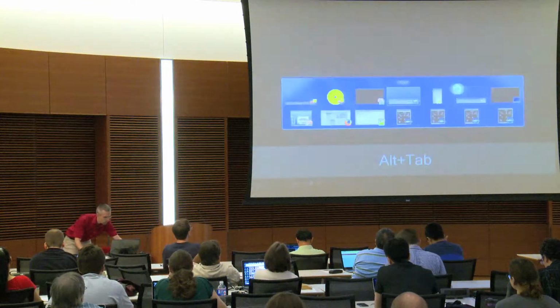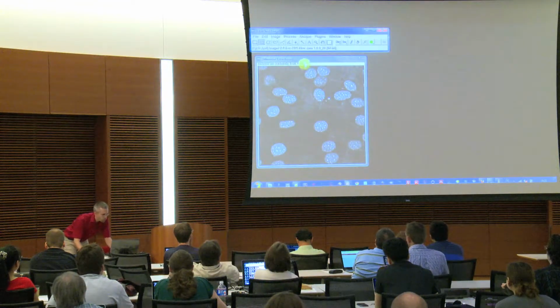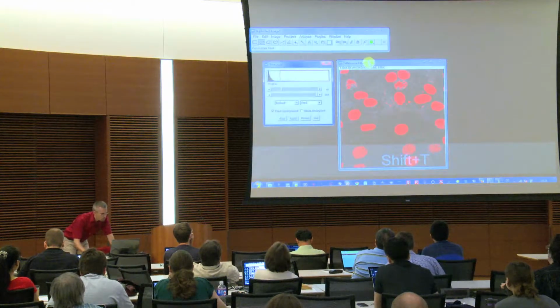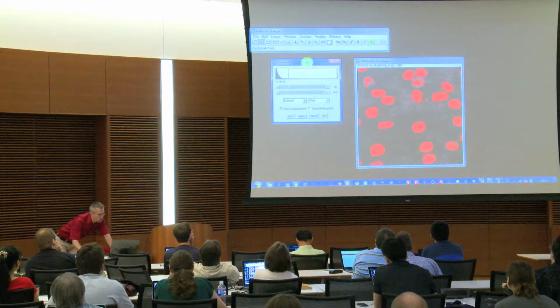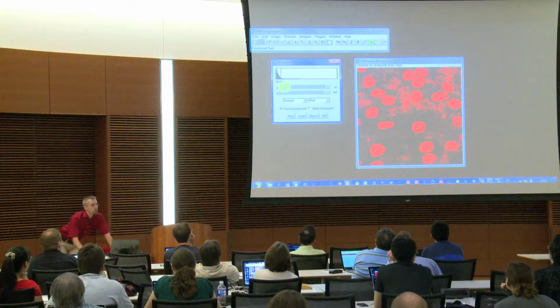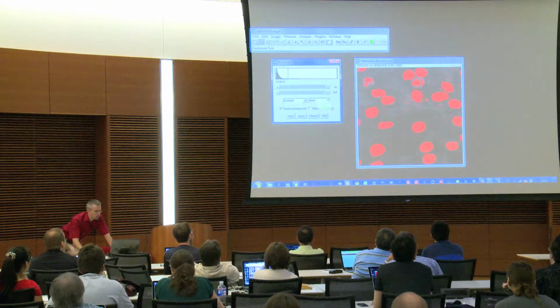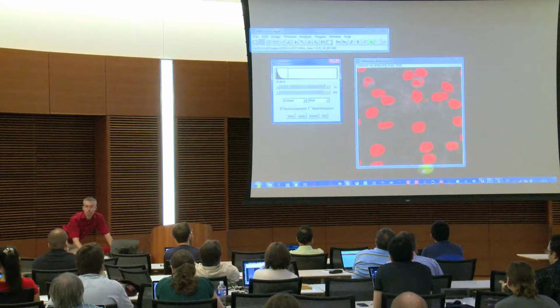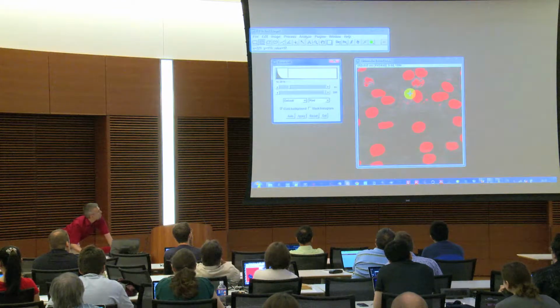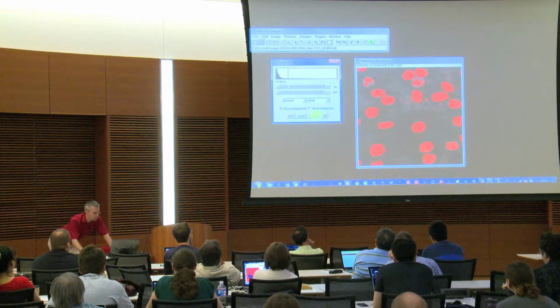You will very quickly figure out that it is a very difficult task, because either I get my bubbles and a lot of background, or I get rid of the background and then I don't get those features completely. So that's already where I have a problem, at least when working with the original image, and that's when filtering becomes important.